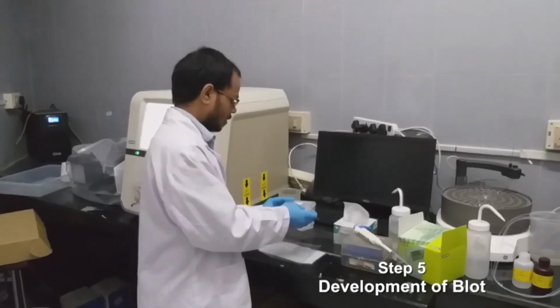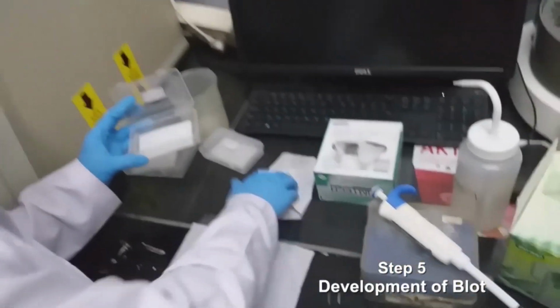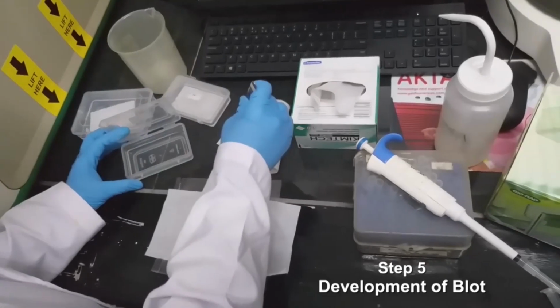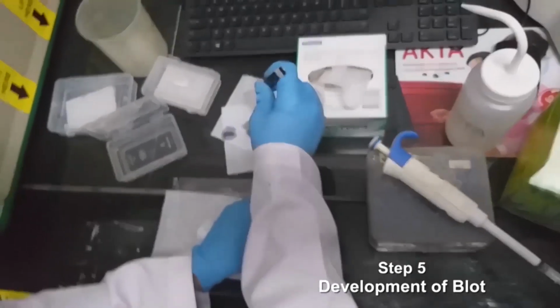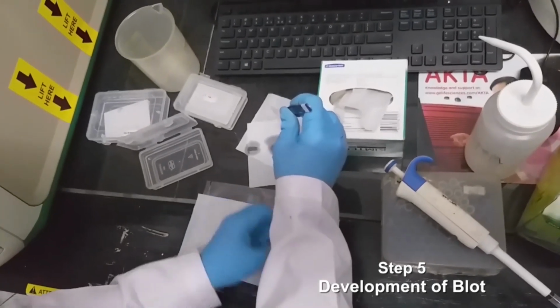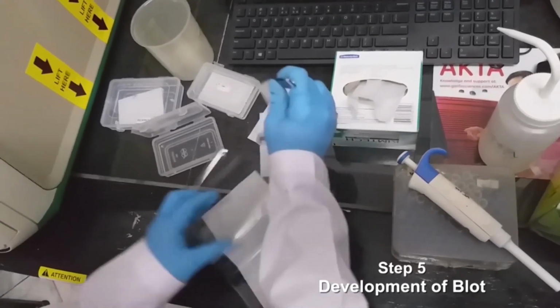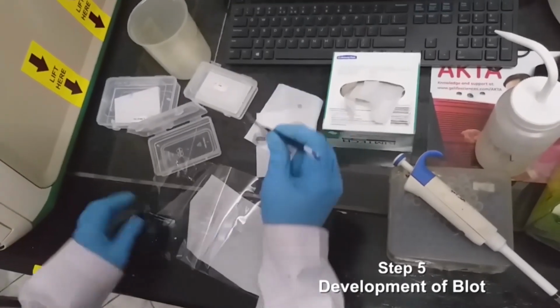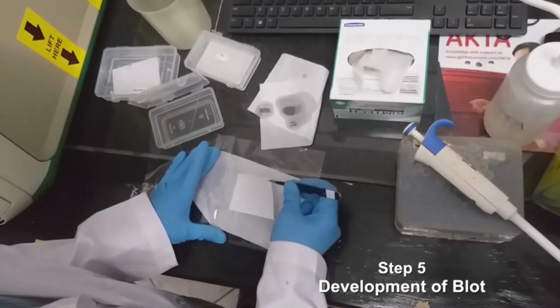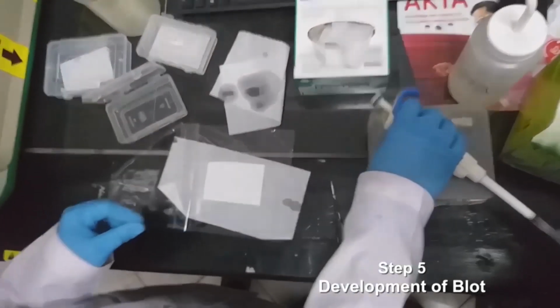So we take out the blot and drain the buffer properly. After that we keep the blot in between plastic foils.